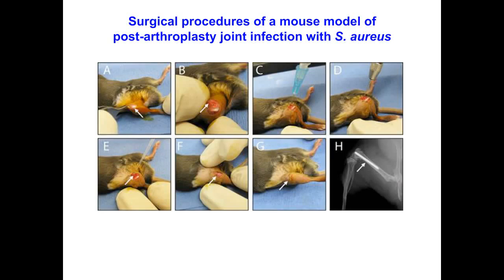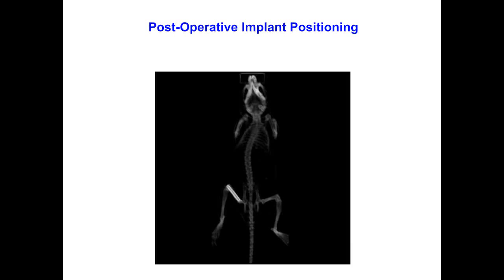And you can see here, these are the micro CT pictures, and you can see good placement of the implant representing the model. We do have a media file here to show that if it's easily accessible. If not, we'll just go forward and we'll get to the media files maybe at the end.